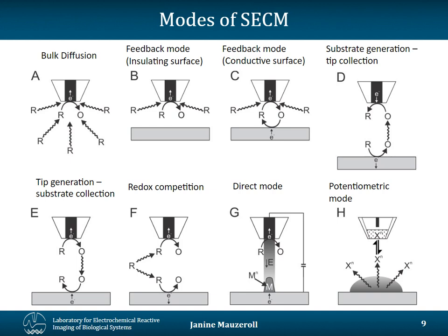And so therefore, scanning electrochemical microscopy is highly influenced by how fast species move in a particular media, but also how fast that electron, which you see in the dark portion of the microelectrode, gets transferred. And so when the microelectrode is very far away from solution, we have hemispherical diffusion.